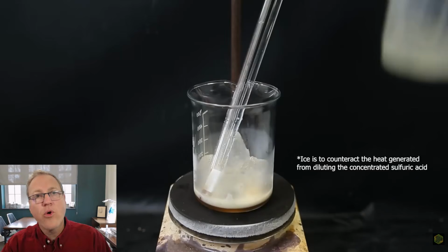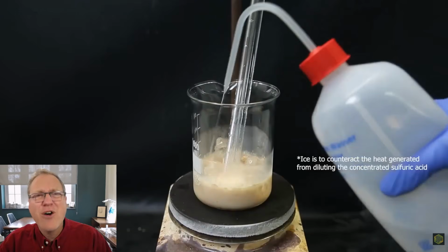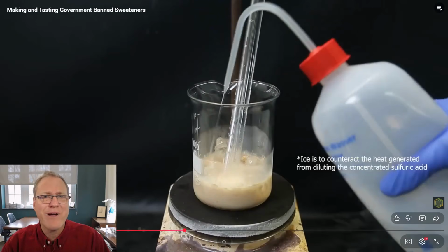This idea of pouring a reaction onto ice, that is all over the older literature. I never liked pouring stuff into ice. I was more a fan of, I'll just cool the reaction and maybe drop-wise add cold water. But pouring a reaction onto ice to quench reagents or cool the reaction, that's a really common approach, and here he's doing it. And then mix it around. I dilute it with more water. I always hated that ice in there. It's such a pain. You got these ice cubes. I don't want ice cubes in my reaction.